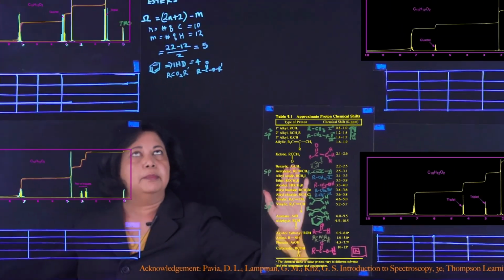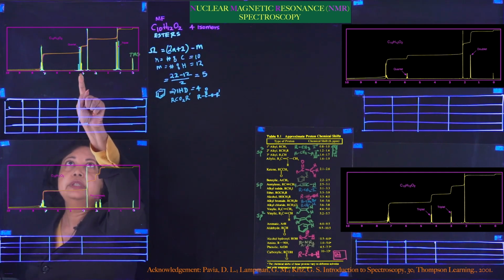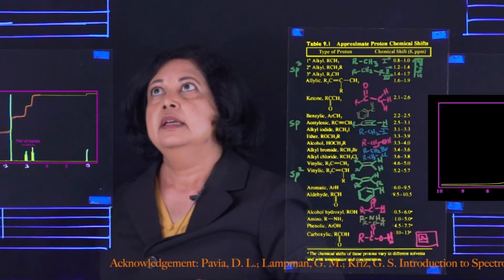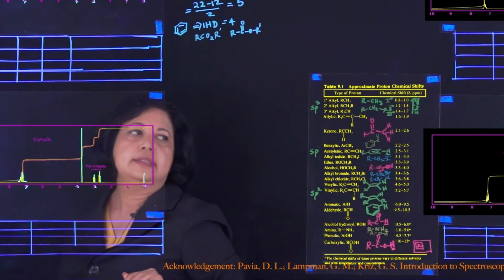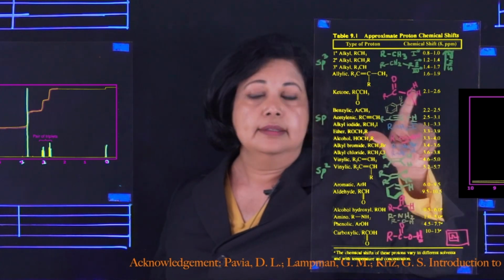And so how do we apply that to this? We have to really look at the ppm values here. So this is next to a 4. So chances are that is directly next to an oxygen. Now over here you can see these are next to 3s. So that could be next to like a benzene and a carbonyl.